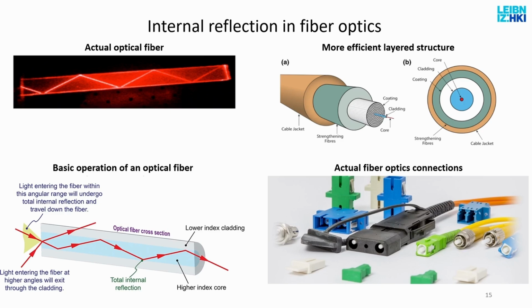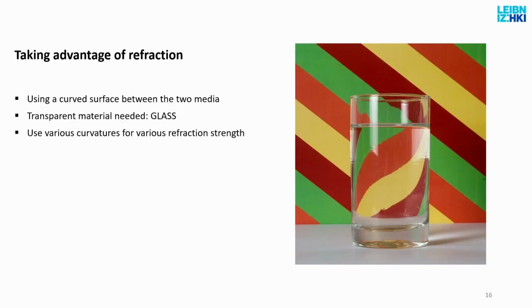We need that because, for example, in a microscope, I want to use lasers for illumination. Do I want my laser traveling across the room until it gets from the laser to the sample or not? So I want it to go directly from the laser to the objective lens to the sample to illuminate my cells, my nuclei. So I will use optical fibers to lead the light from it. And so your internet connection nowadays is running through optical cables.